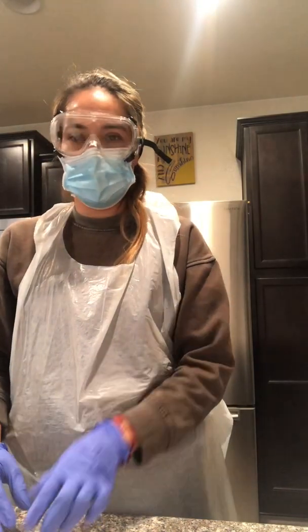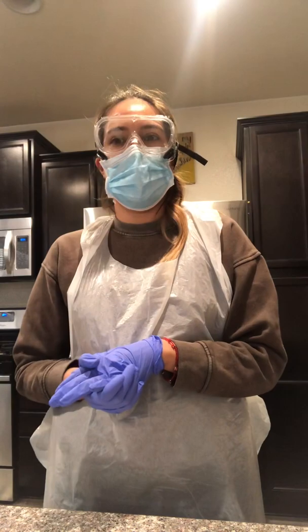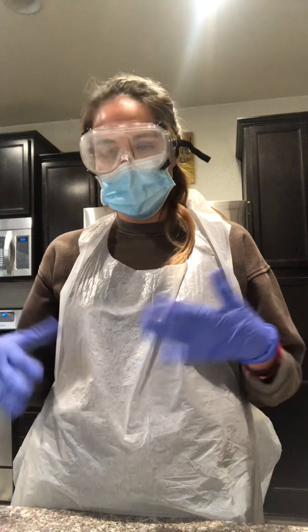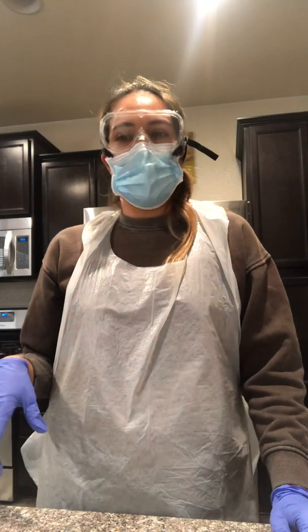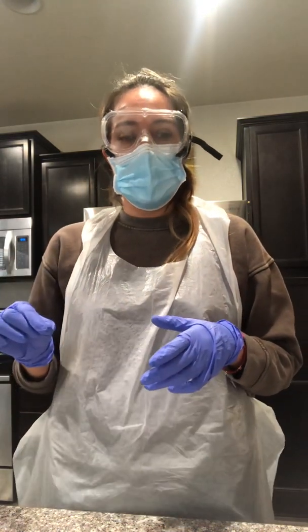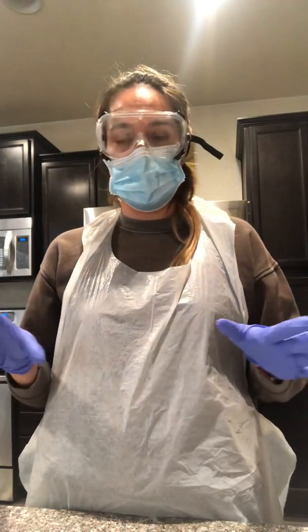Okay, now I'm going to answer 3 questions. For the first question, explain whether the experiment was successful. I believe I was successful in my results because I did see some of the colonies that grew on my plates, and I would also expect to see more results on my plate 1, 2, and 3, because those are the ones that I felt I had maybe more of the yeast than in plates 4, 5, and 6.